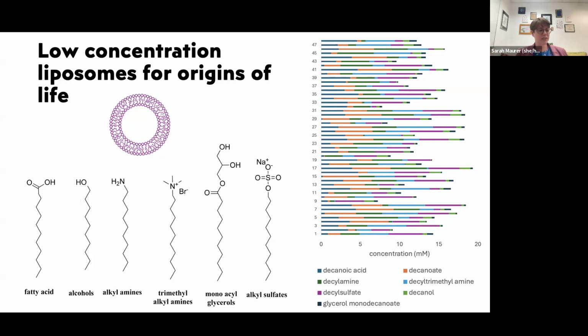So the microscopy is done with Nile red fluorescence. And we are not limiting the size of the vesicles, but there is a limit to what our confocal microscope can see. And so I think the smallest thing we could probably detect is a few microns. I think it would be hard for it to template match anything smaller than that. And obviously the largest things are many, many microns, tens of microns.